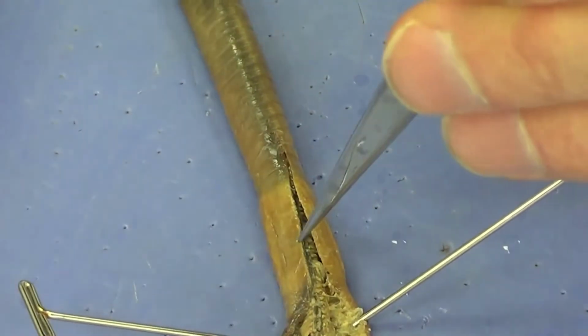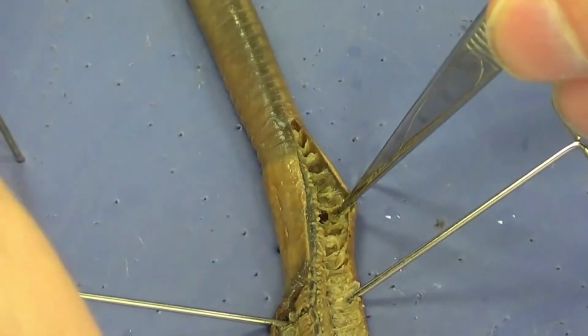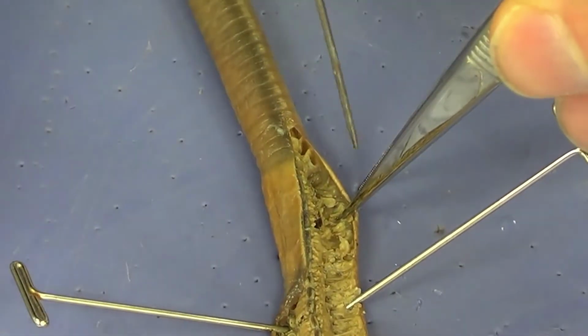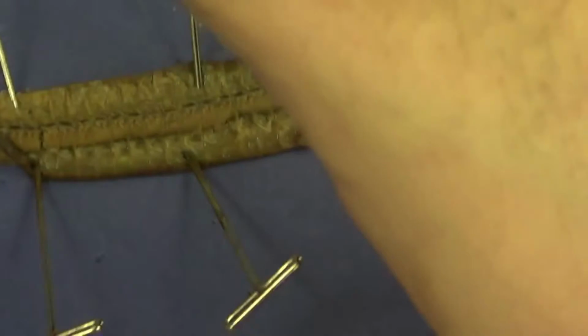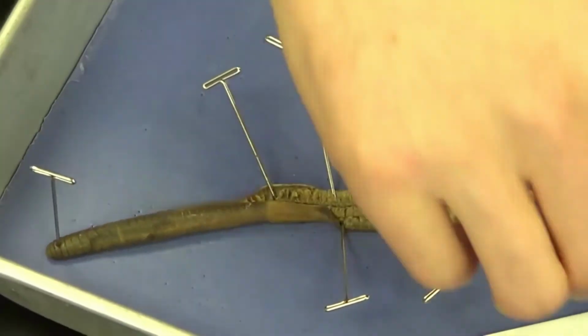And I'm going to, with my forceps, pull back the skin very gently. You can see some of the septa are still intact there. I'm going to go ahead and cut through those septa. I'm going to pin this back, making sure to keep my pins very shallow, or coming in at a very low angle. Now I'm going to go ahead and do the other side.